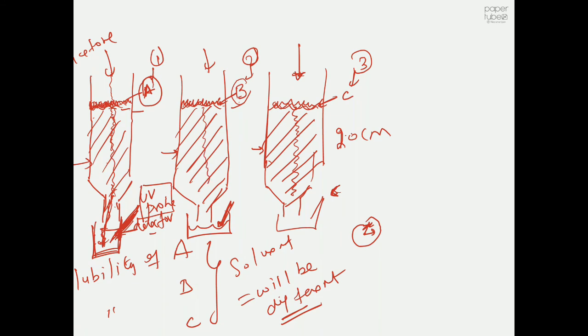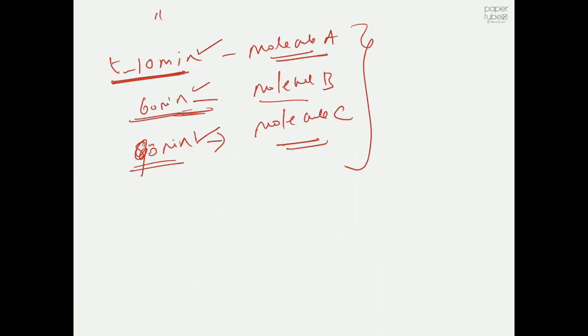Yeah, so something like the adsorption force, if you want, we can define it that way. So compound C is strongly adsorbed onto the silica particles, that's why it spent a relatively higher amount of time in the stationary phase, whereas molecule A is weakly adsorbed onto the silica, that's why it spent relatively less time in the silica particles or in the stationary phase.